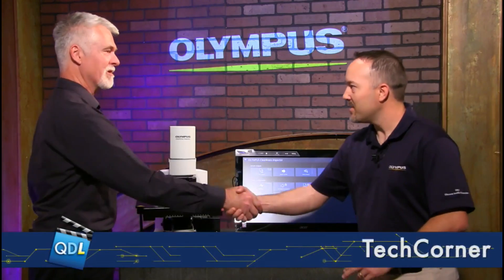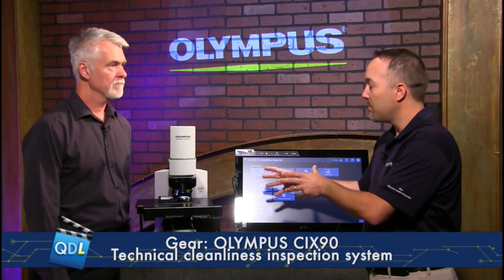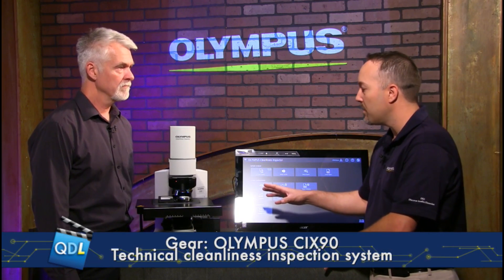Dirk and Rob, take it away. Thanks Mike. Welcome back once again. So this is a particle inspection, cleanliness inspection — looking for particles on filter media for this system. This is our Cleanliness Inspector, model CIX90. It's a new hardware platform compared to our old system. It's a fully hands-free system — there's no sliders or mechanisms that the user has to interact with on the microscope hardware itself, which automates the process even further.